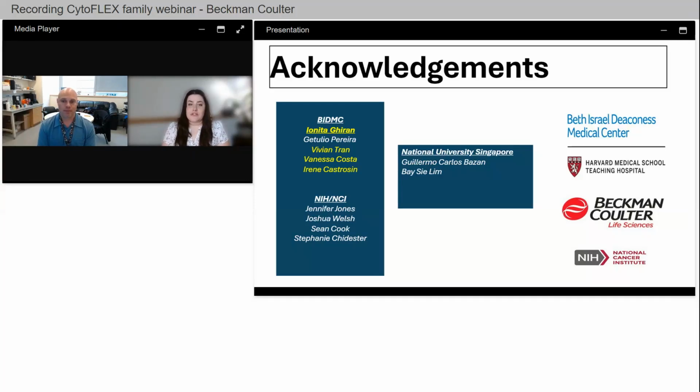Our last question asks, could you discuss the implications of standardizing nanoflow cytometry data for collaborative research efforts? And do you think this makes replication of data and collaboration easier? This is a very big topic. It actually has its own working groups and task force within ISEV and ISAC, flow cytometry and EV science.